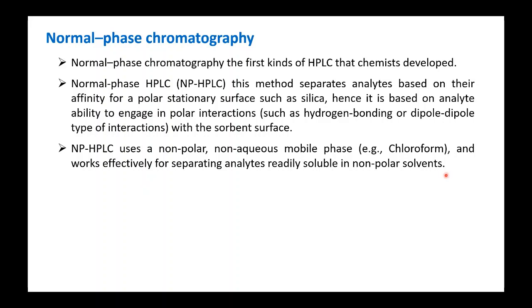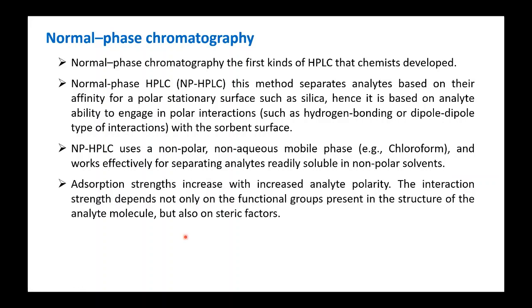Adsorption strengths increase with increased analyte polarity. So if you have a more polar compound, that will bind more strongly on the silica surface. That is what is told here: adsorption strengths increase with increased analyte polarity.